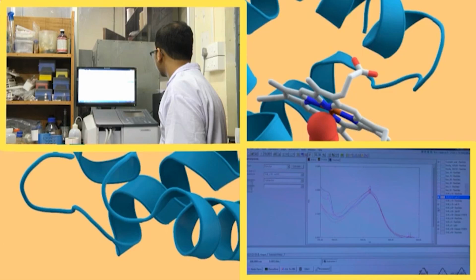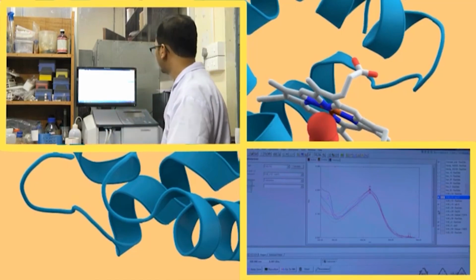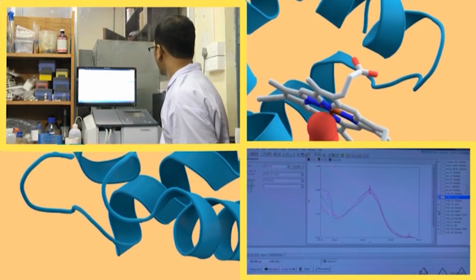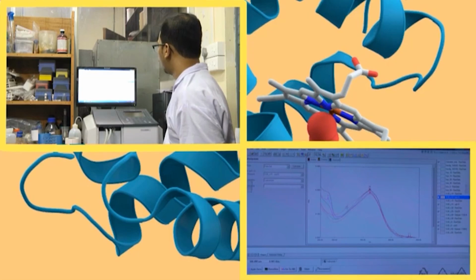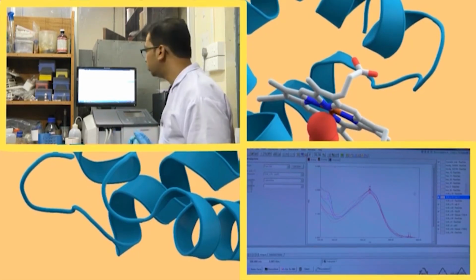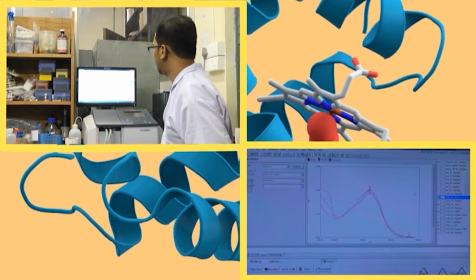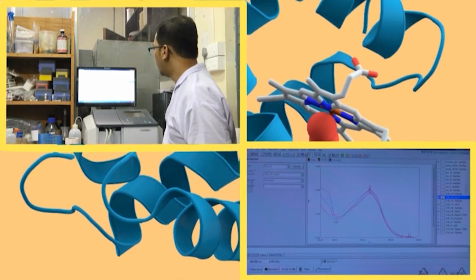Actually, all those names have similar names, subtraction, so it will be a bit difficult to find out. For convenience I am showing this red line, what you can see out here has a particular absorbance value. Now, some absorbances are getting decreased, some are increased. In this region some are getting decreased, some are getting increased, whereas in this region, around 300, everything is getting decreased.